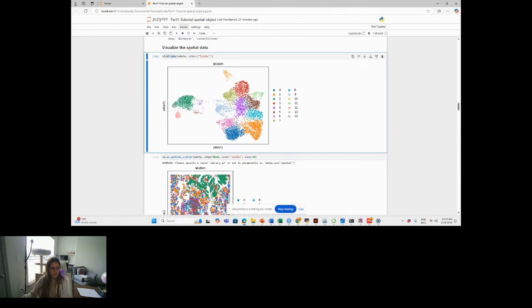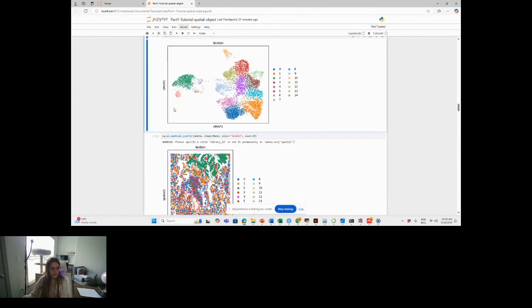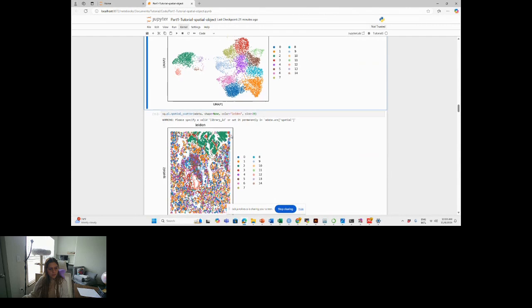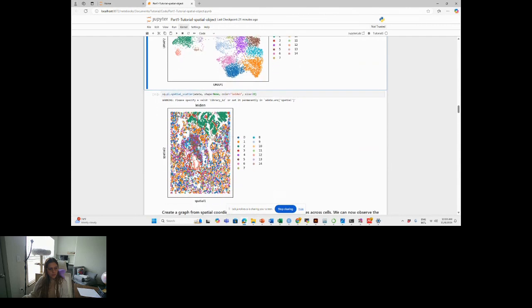Now, once you mark these cells as green, we're not given a cell type name yet. Once we put them a name, green, because they share the same gene expression, we can go back to the spatial, how they are distributed. And we see that the green cells, in this case, are close to each other. However, there are some others, like the orange ones. Orange ones form a cluster, which indicates that they may have a similar cell type, but they are distributed everywhere when we look at the spatial information.